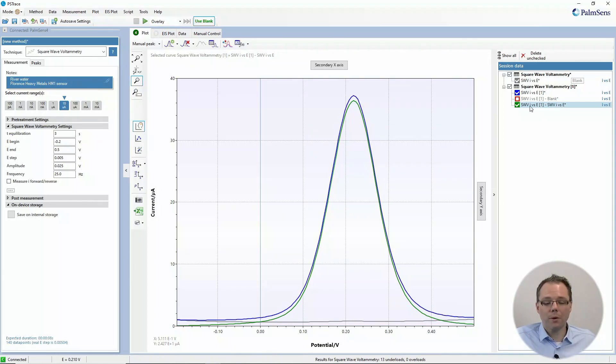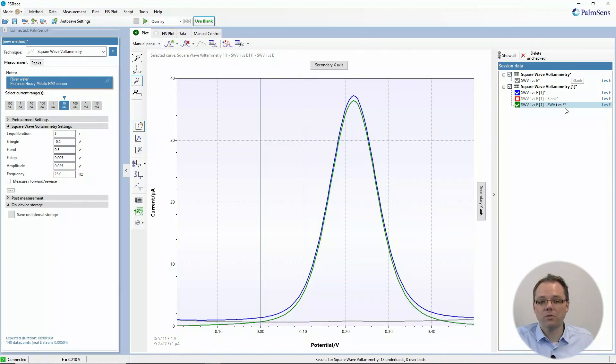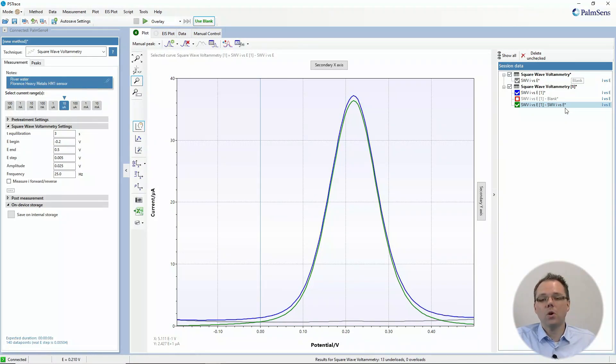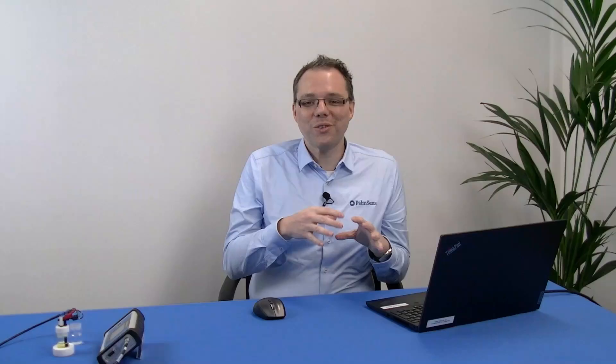This is a manual way of doing it. The result is of course the same as for the automated version, but it's good if you've already made your measurements.